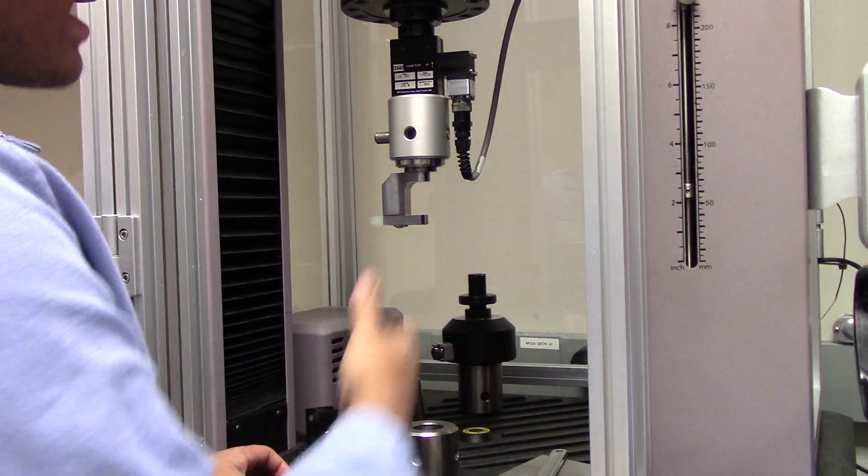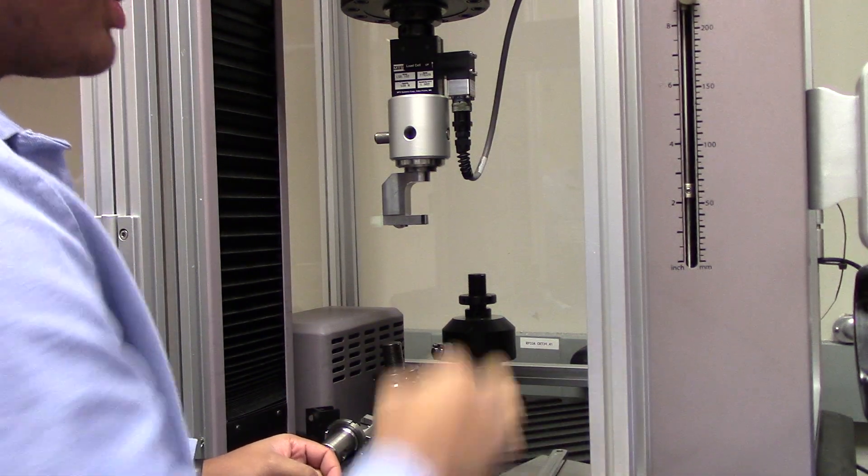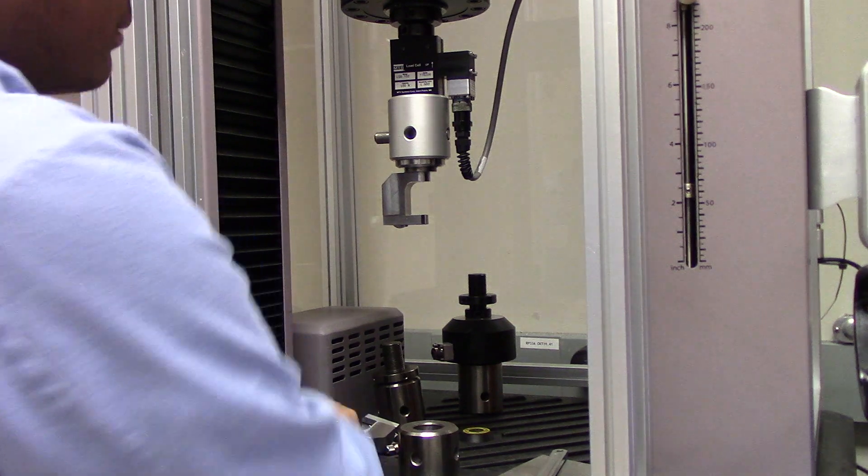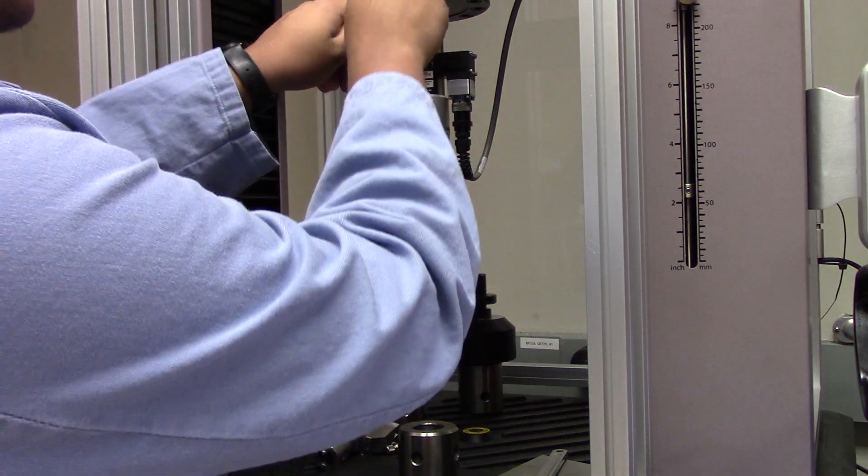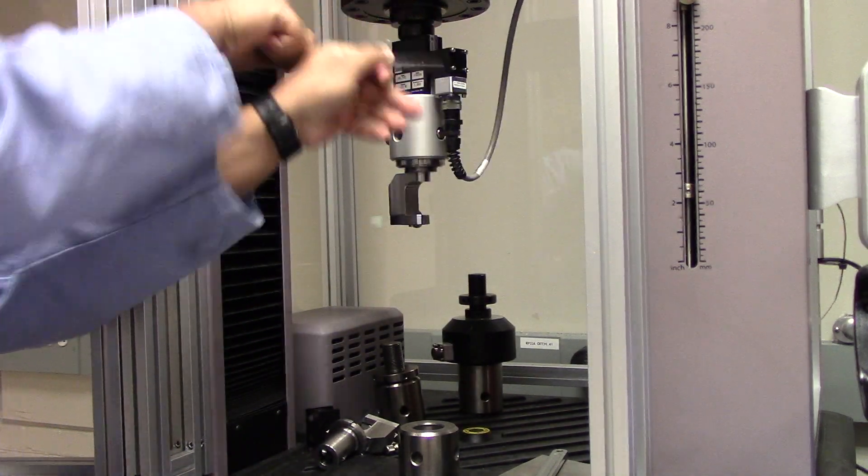Moving on to the upper grip, the first thing to make sure of is that the power is off, as we don't want to be handling any live wires. As was shown just earlier, place one rod into the lower lock nut, and one into the upper lock nut. While holding the lower lock nut steady, rotate the upper lock nut clockwise to loosen the system.